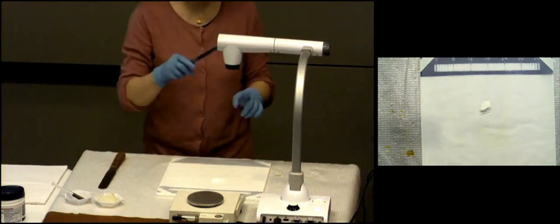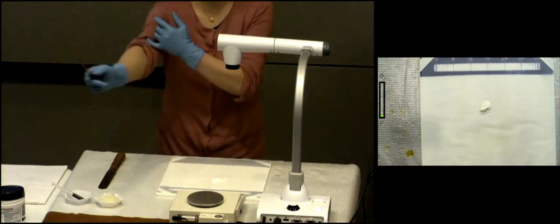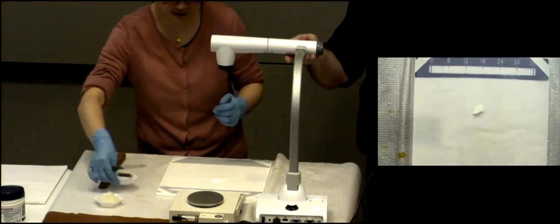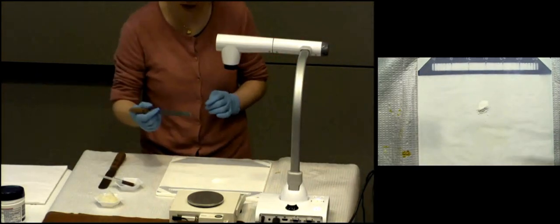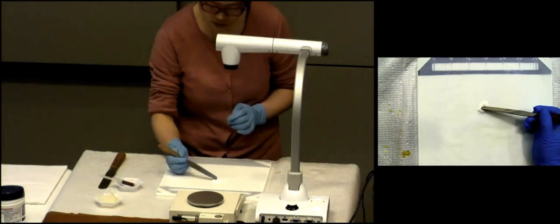All right, Larry, can you make this slide bigger? So, you know. Oh, come on. Let me line up there. Okay. All right, so we're going to do levigation here. So you can use your paper. Oh, yes, that's right.